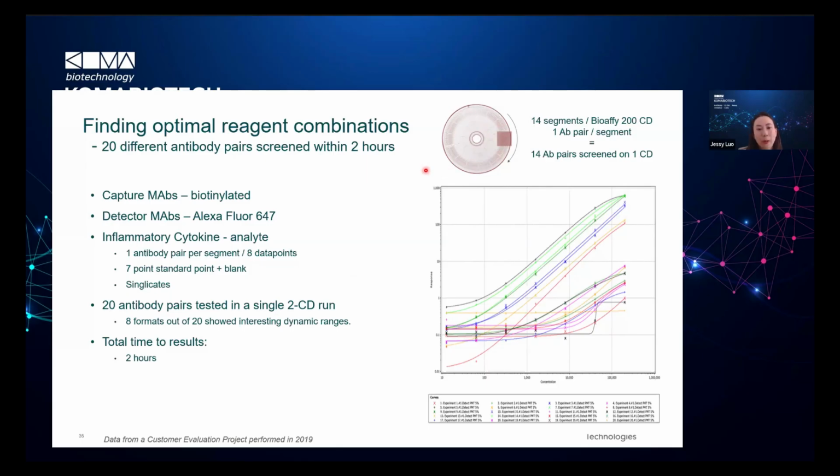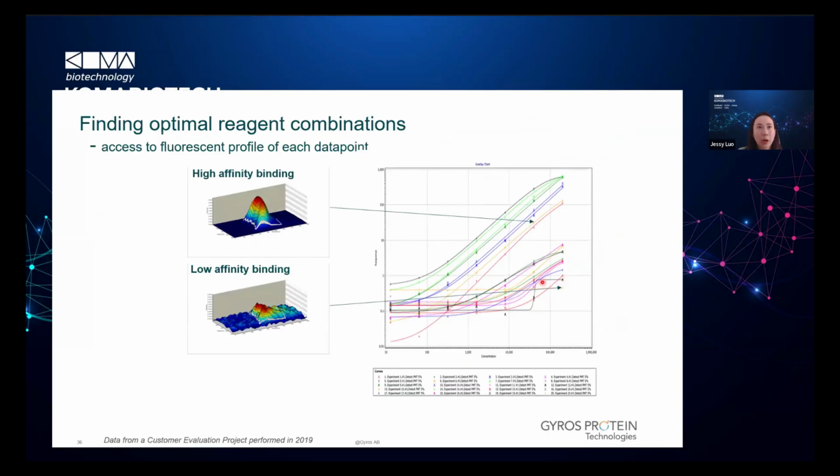modify which 2 antibodies you want to get together in the software directly. And also the good thing about getting your results, one thing is we could have the standard curves like this to justify whether this is a good or not good antibody pair. But also you can use these fluorescence profiles.